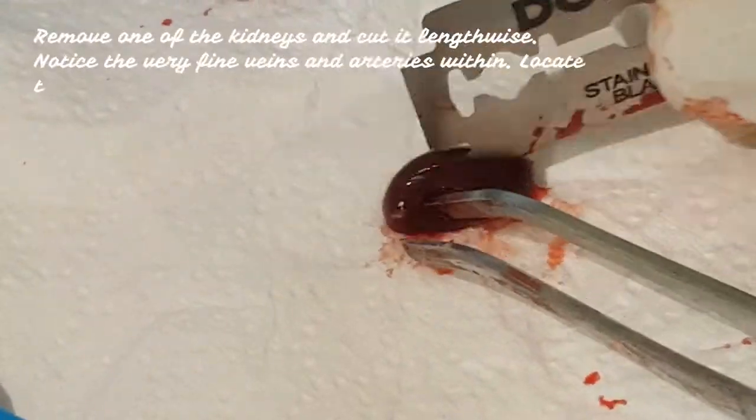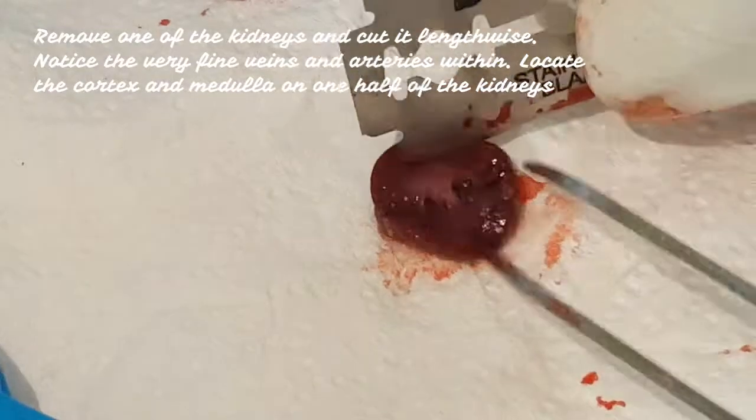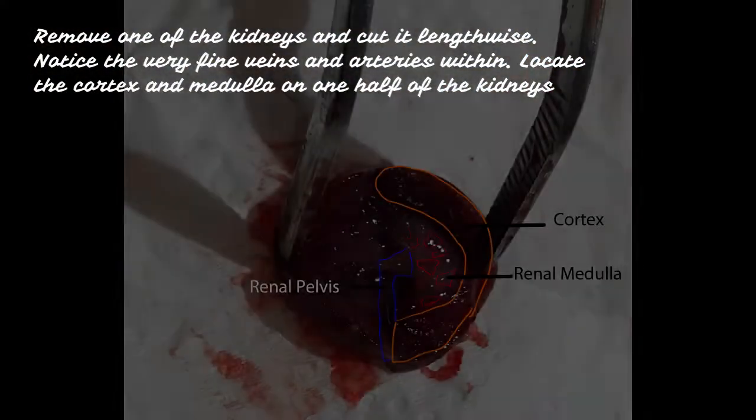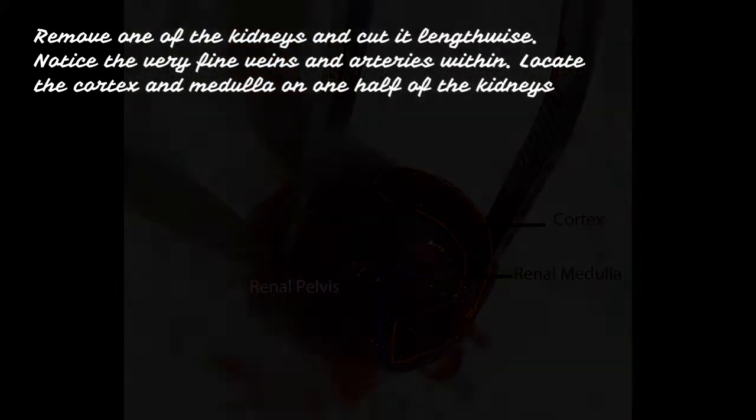Remove one of the kidneys and cut it lengthwise. Notice the very fine veins and arteries within. Locate the cortex and medulla on one half of the kidney.